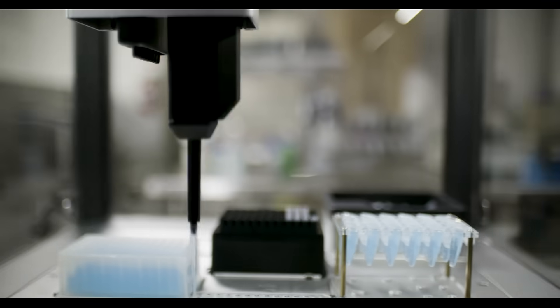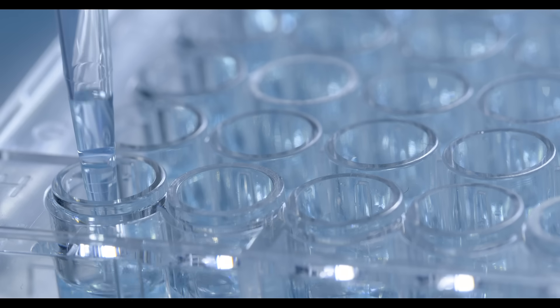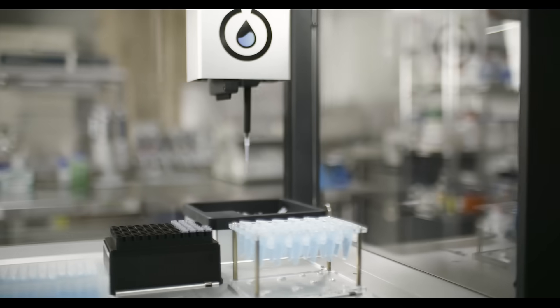And you can use most standard labware and consumables, just like if you were running your experiments yourself by hand.